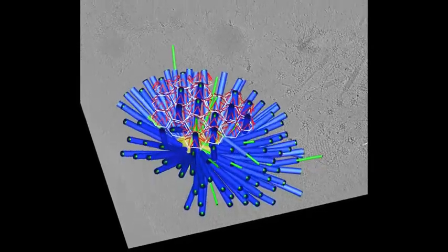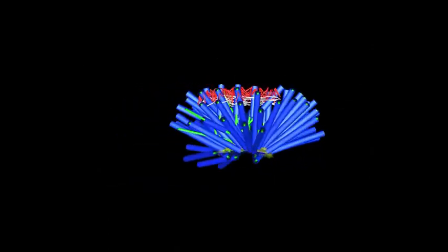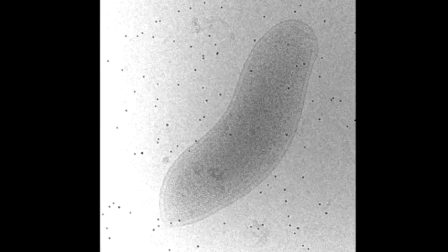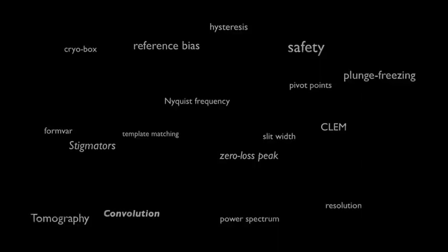As a result, sometimes a few good images is all that's needed to discern between different models for how things actually work. So like the famous late Caltech physics professor Richard Feynman once said, it's very easy to answer many of these fundamental biological questions. You just look at the thing. In a growing number of cases, cryo-EM is the best way to look at cellular and molecular biology.